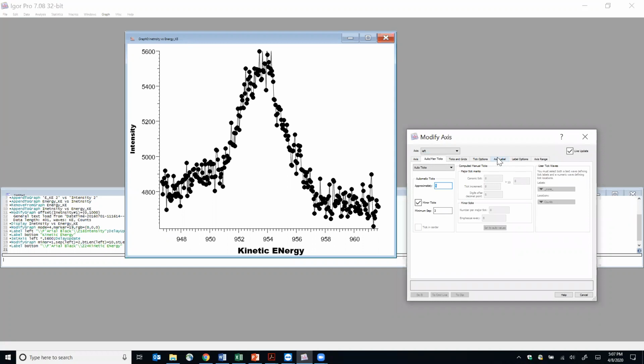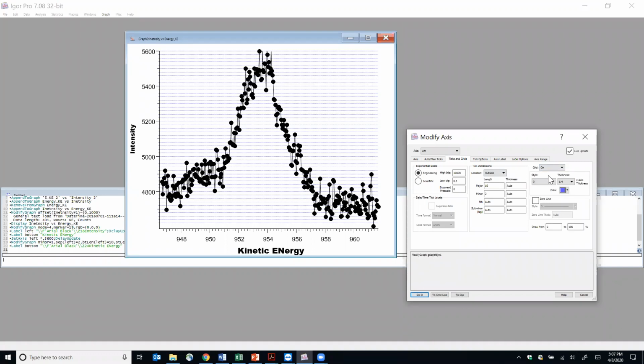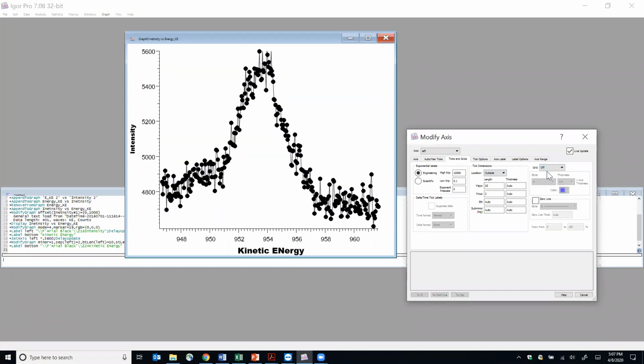Sometimes, just to make the graph nicer, you can go to the axis section. Here, for example, this is the position of the ticks. If you want them inside, you can see that they went inside. Now I can put them crossing like this, or outside. If you want a grid, you can just turn it on and you have the grid on your y-axis.